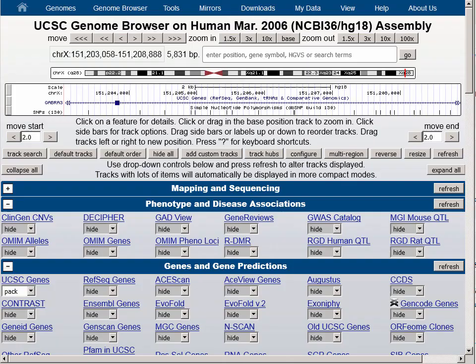When we learned that people were using this definition of polymorphism to filter out what they believed were common variants from their datasets, the UCSC team decided to help make it more clear. The dbSNP database contains essentially any variant that has been detected and submitted, without regard to how common it may be in the population. If you take the SNP130 track and filter your sample with it, you are filtering out a lot of rare variants as well, so the word polymorphism is probably inaccurate in this context. In SNP tracks on HG19 and thereafter, the common SNPs are separated by UCSC, as we shall see.